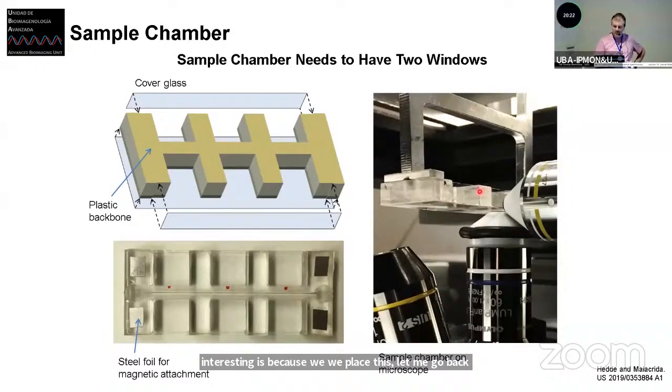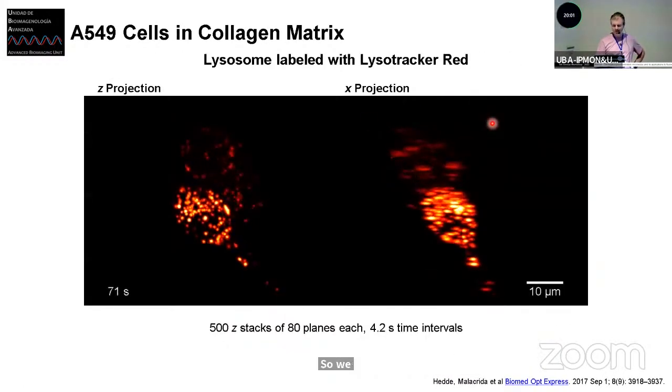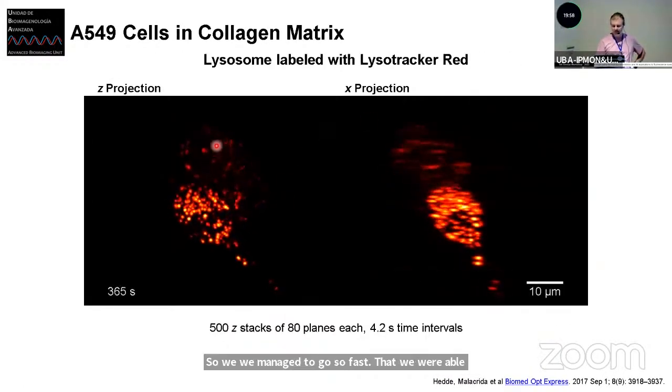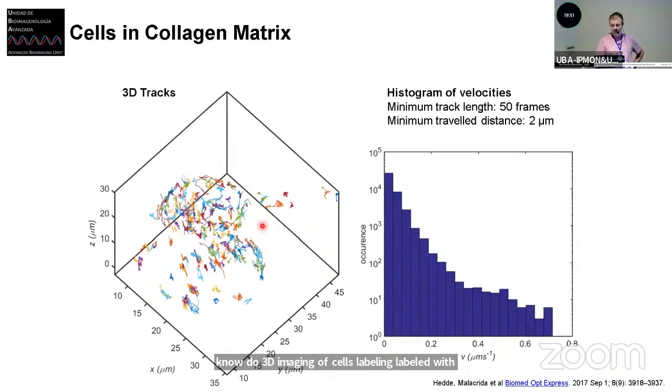We place our chamber in some sort of adapter that we made here, which was controlled by a piezo stage. So we move in Z the position of our sample very, very fast and with a very high resolution in the steps. So we managed to go so fast that we were able to do 3D imaging of cells labeled with LysoTracker, and fast enough to do tracking of these lysosomes, not one at a time, but all the lysosomes of a cell at the same time, because the whole stack of a cell took less than a second.